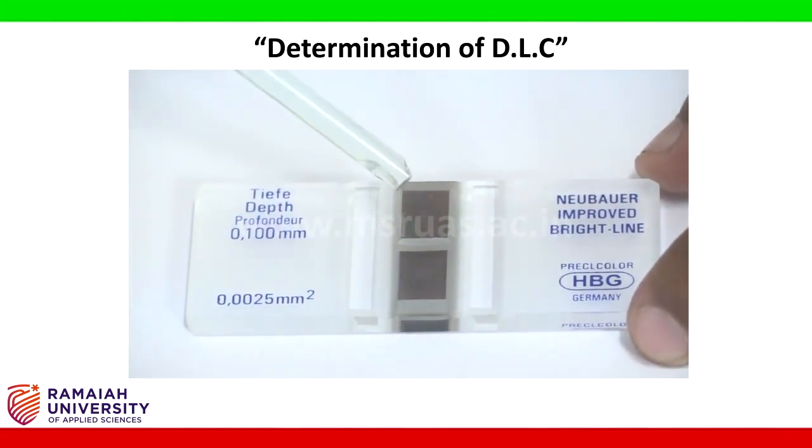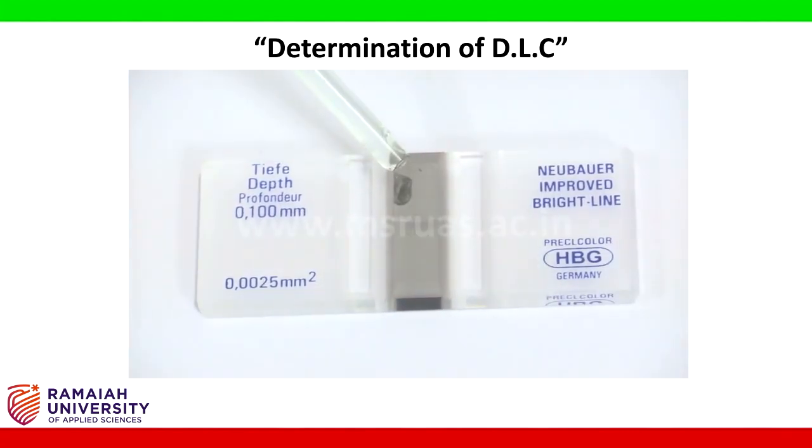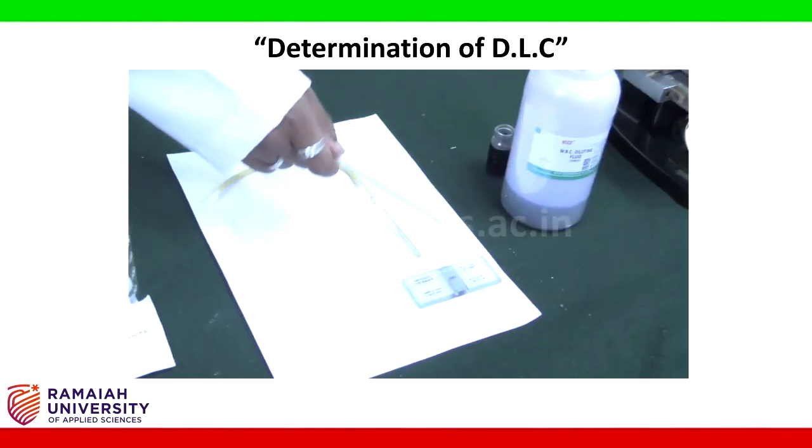The floor piece is divided into two equal parts by a short H-shaped trench in its middle. Identically ruled areas called counting grids, containing squares of different sizes, are etched on each floor piece. The counting grid has the following dimensions.